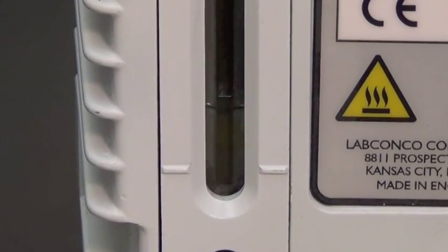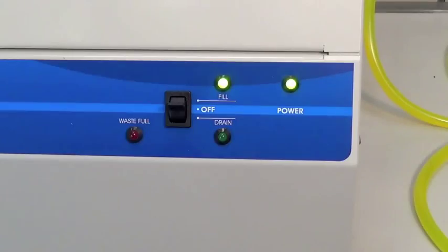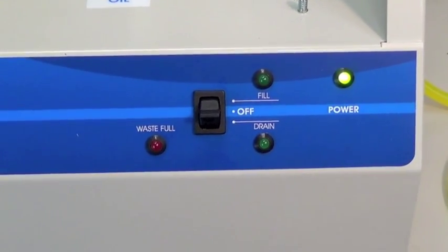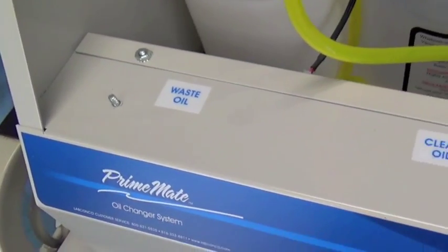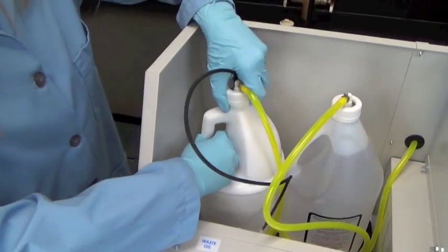Monitor the fill process by watching the sight glass on the vacuum pump. When it's at the appropriate level, turn the fill switch to off — the Primemate will stop pumping. The alarm light will indicate when the dirty oil container is full. Dispose of the dirty oil according to your company's policies and replace the container.